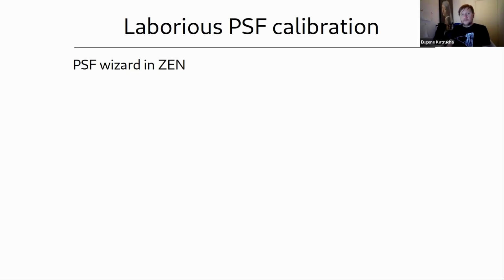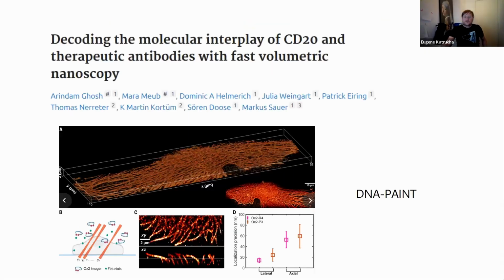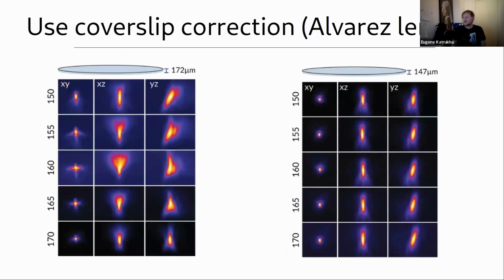And still, even with this thing, this story about the point spread function was worrying us a little bit. And the interesting story is that after a couple of years, we received the serial. So we were in this first user program where we had this experimental microscope, and then at some point it was shipped to Zeiss, and they shipped us the new one. And in the new one, the astigmatism was much less, so the point spread function was much better.